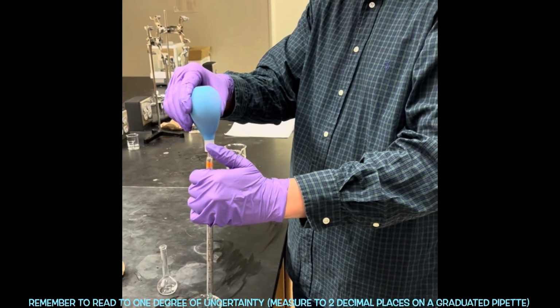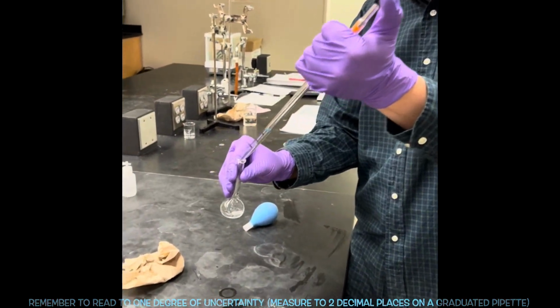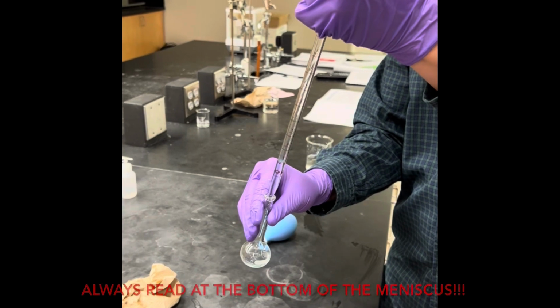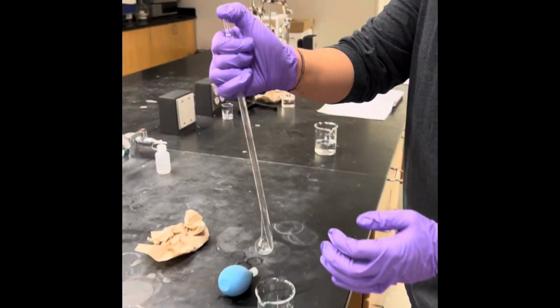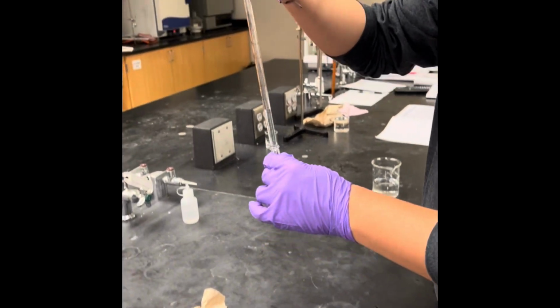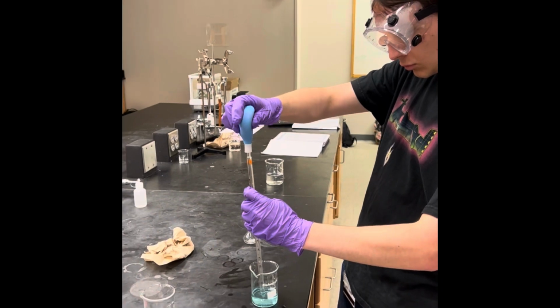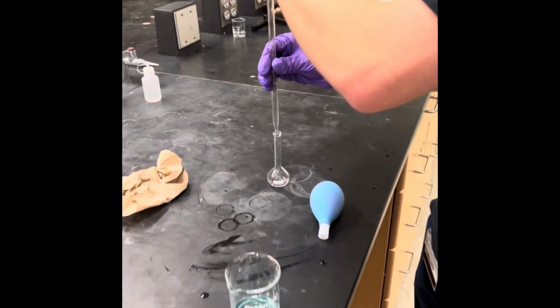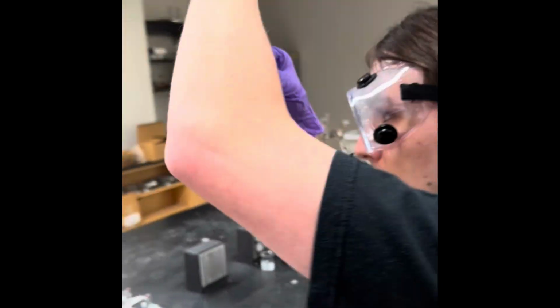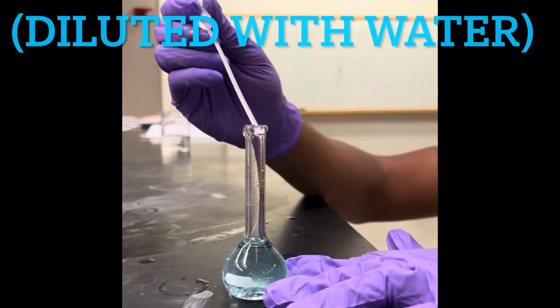The solution is then transferred into a volumetric flask using the pipette. The solution is then diluted in the volumetric flask using the transfer pipette.